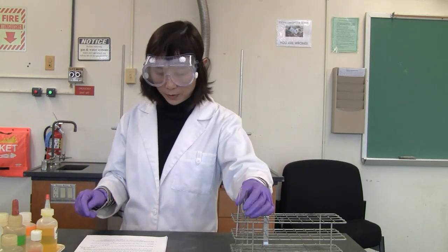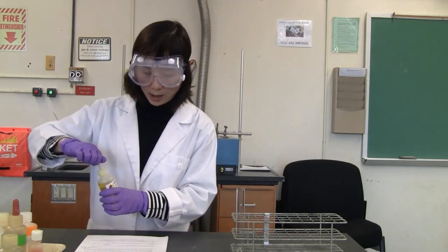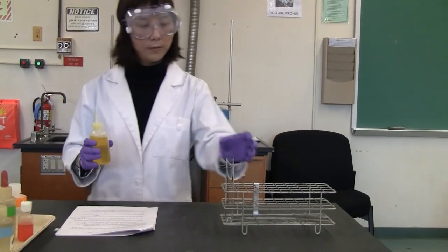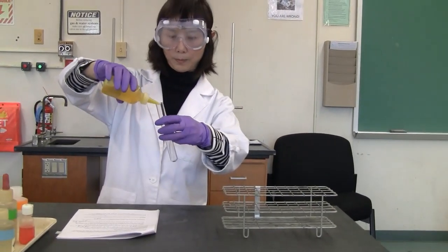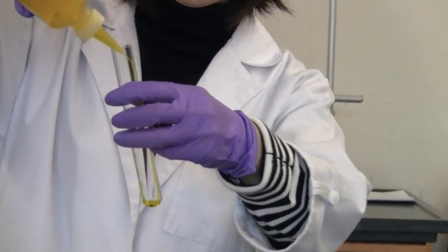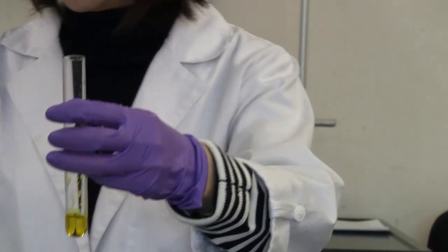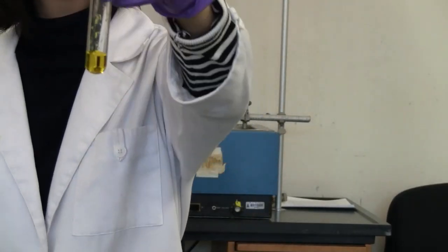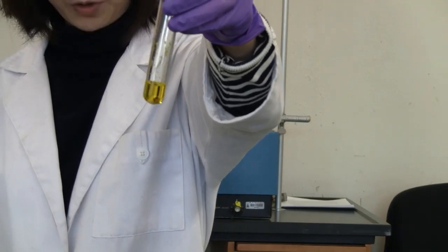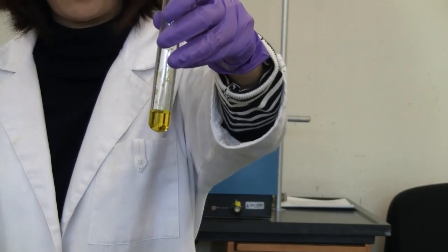So step 1, I'll place 3 milliliters of potassium chromate solution in a test tube. 3 milliliters. What color is the solution? Observe and write down the color next to the equation above.